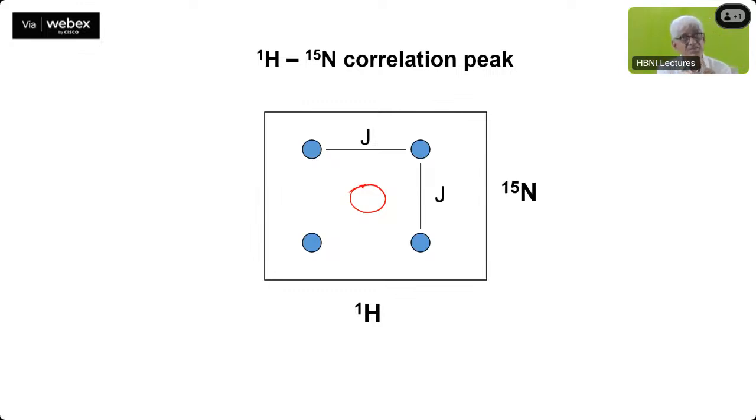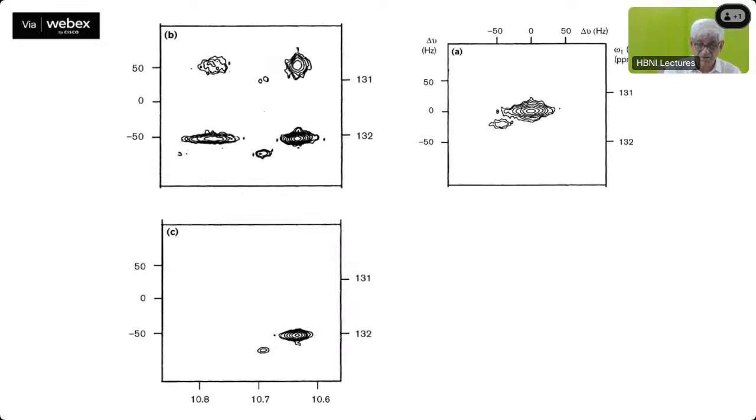And that is, cancellation is maximum at that point. And that happens differently in different components. It is in one component which is maximum, and that component will become very narrow, and all other things will disappear. If you decoupled that, then of course you will find one peak at the center, which has the line width from all the contributions, and that will be a broad signal. The normal HSQC. I will show the effect of that here.